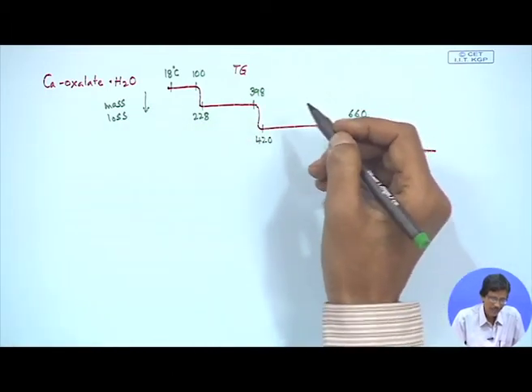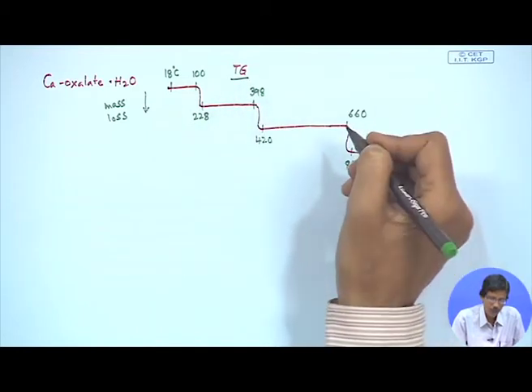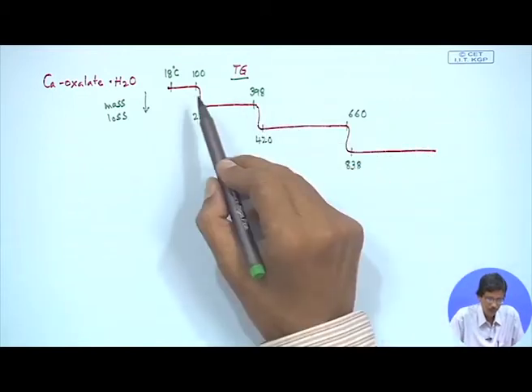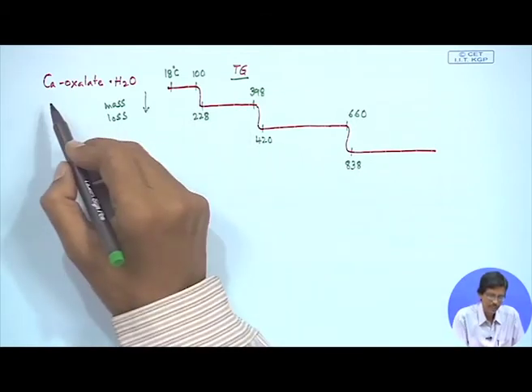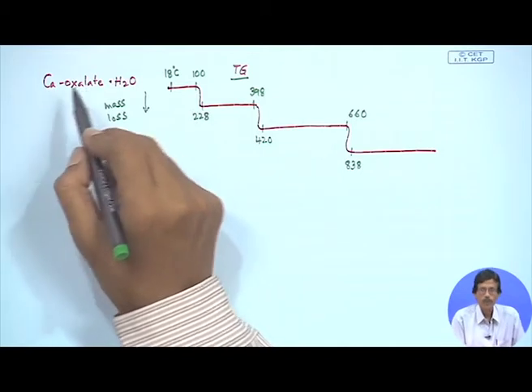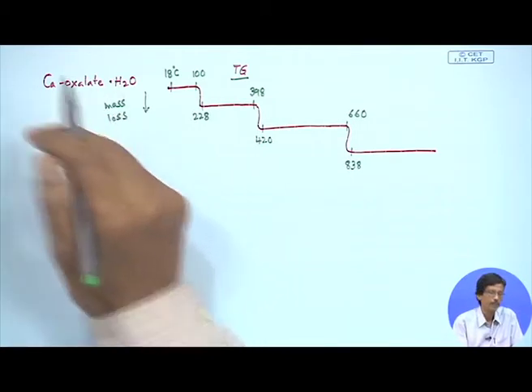So, what we see is that this particular thermogravimetric plot, or the thermogravimetric characteristics, gives us information about their weight losses and at which particular temperature which one is stable, and if there is some formation, that means the calcium bearing compound A is going to calcium bearing compound B, going to calcium bearing compound C and calcium bearing compound D.